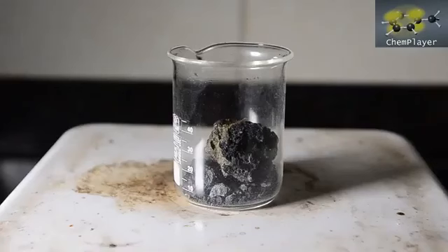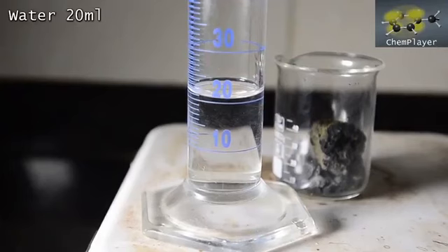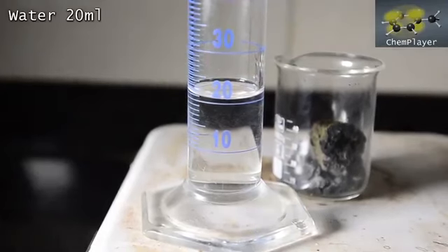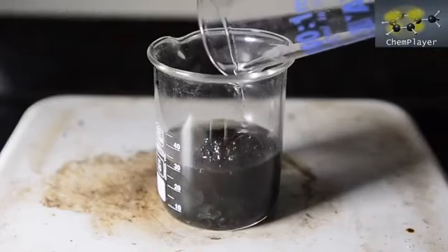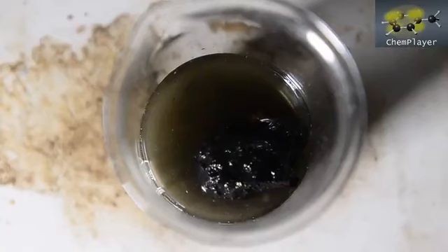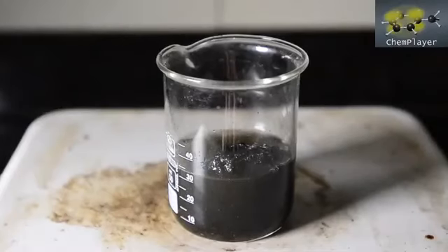Let's get our sample onto a hot plate. First we need to dissolve the water-soluble cyanide salts, and get rid of the insoluble iron and any other insoluble compounds. So here's 20 ml of water. We add this to the solid, and we'll see what dissolves. Some trapped gas bubbles. So it's dissolving in there. We'll get the heat switched on.